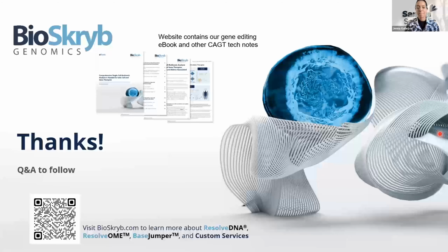Gotcha. Thanks for that. Let's talk a little bit about the predictive algorithms. What algorithms did you test against your data? And for Cas-OFFinder, what mismatch or bulge thresholds did you use? And did you dig into the off-targets that were missed? Can you theorize a little bit about why they might have been missed?